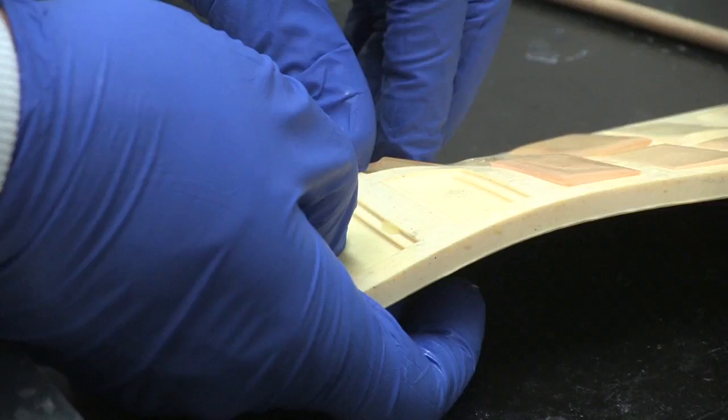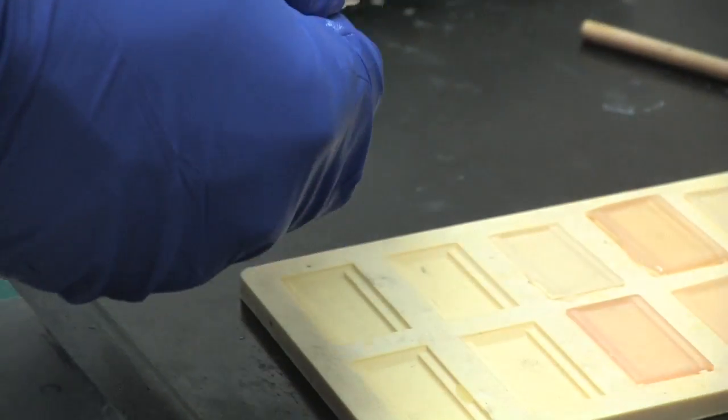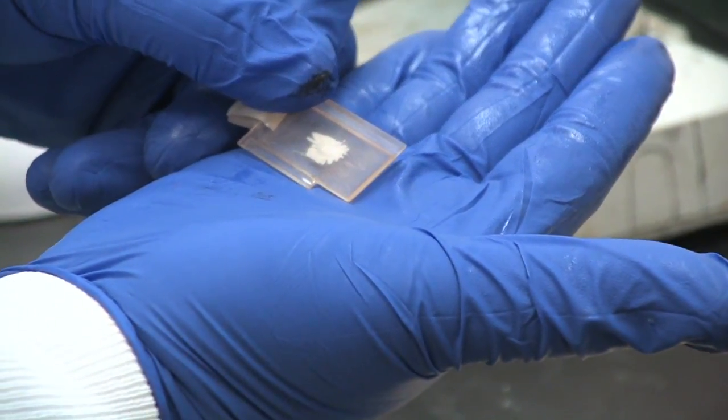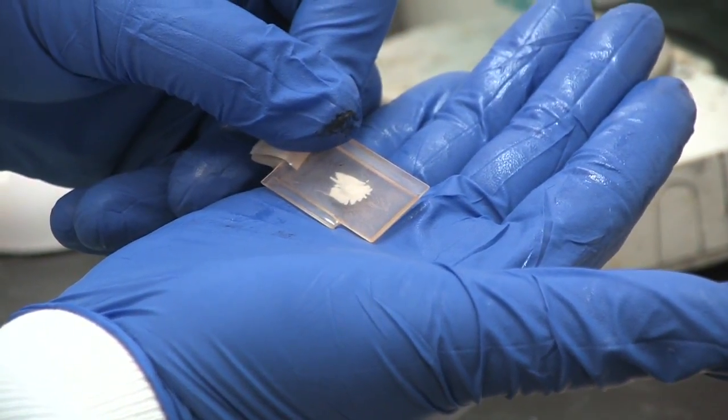This video demonstrates methods for embedding individual otoliths. The entire process requires two to three days and will produce individual molds to be sectioned and used for age determination.